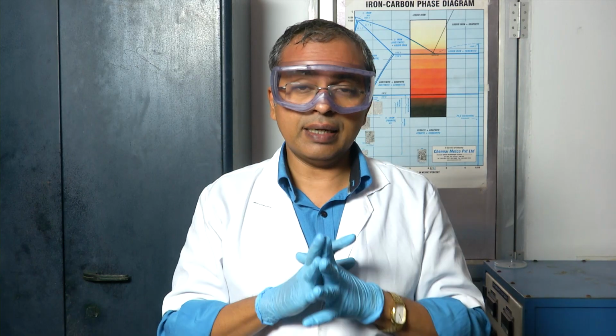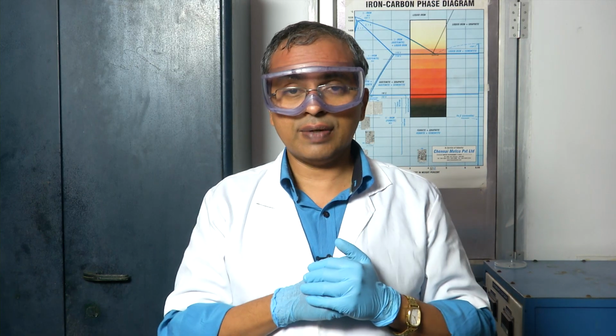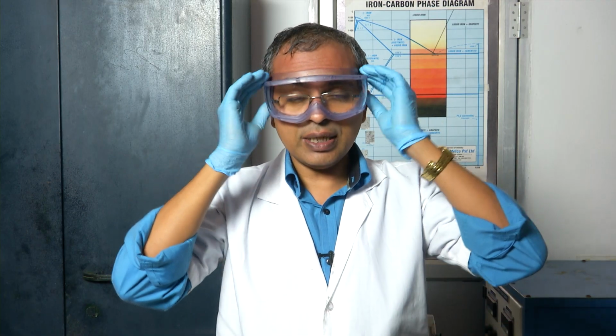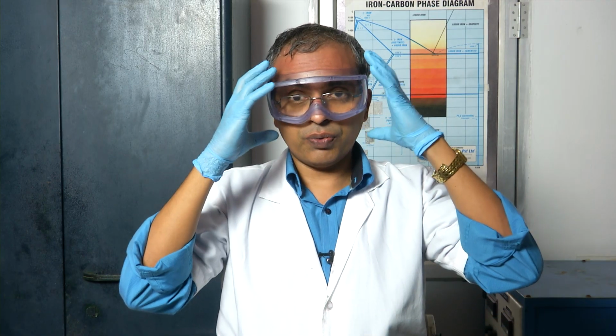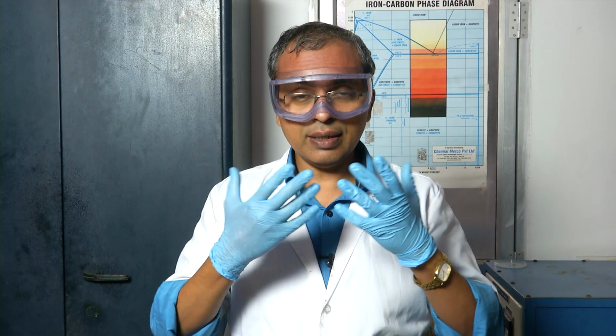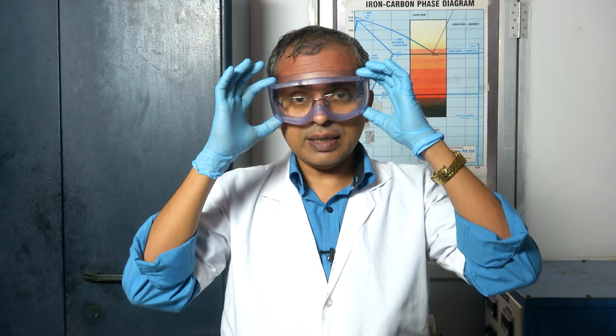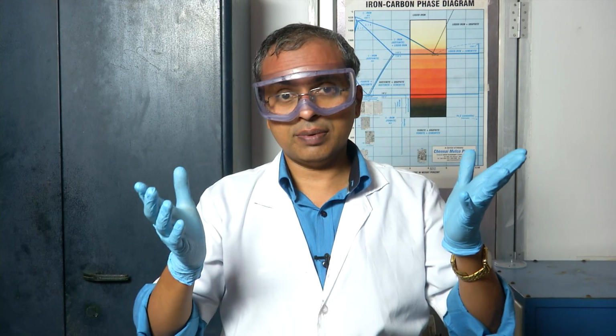Maybe the only thing that may cause discomfort to you, but for which there is a lot of variety of glasses that you can look at, is the fact that it may make it a little hot for you inside here. Based on where you are working, if it is a humid environment, it may tend to become slightly uncomfortable for that reason. But the safety that it provides to you is indispensable.